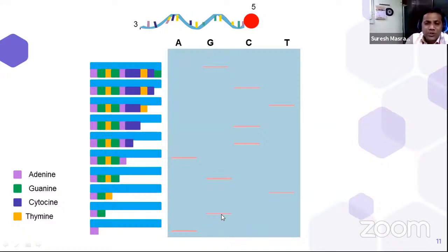Therefore, it consists of only two nucleotides. The first nucleotide we beforehand know is adenine, because the earlier band is in the lane of A, or the first lane. Thus, the second is guanine.